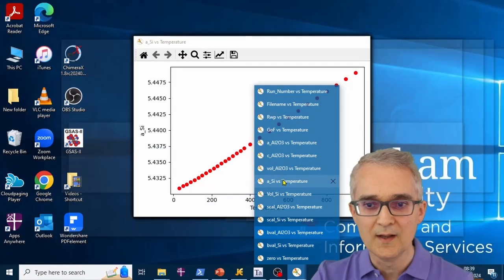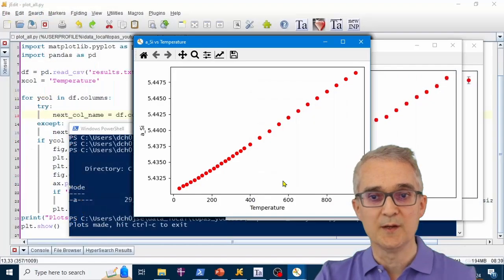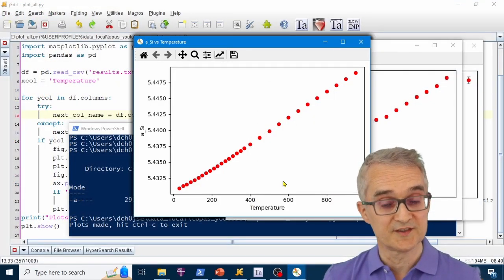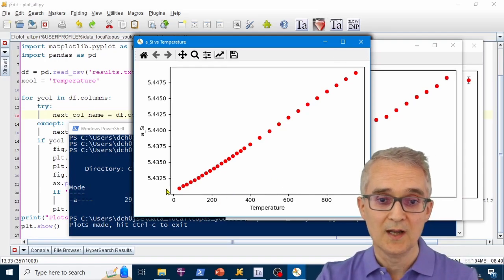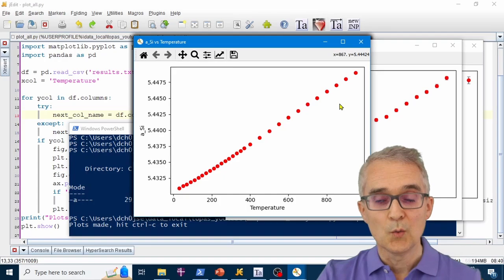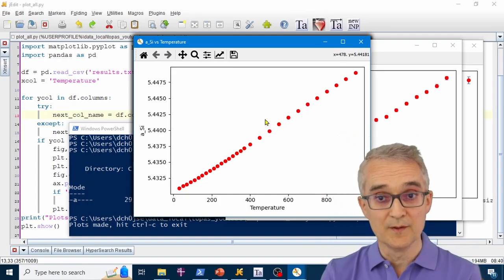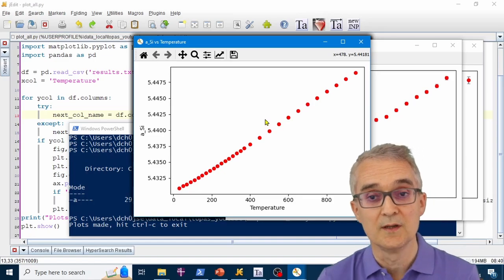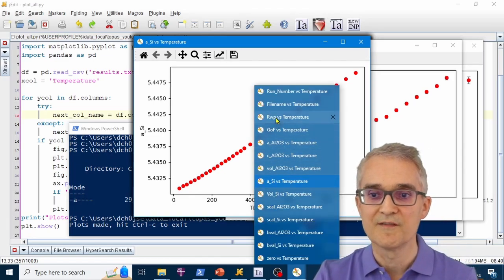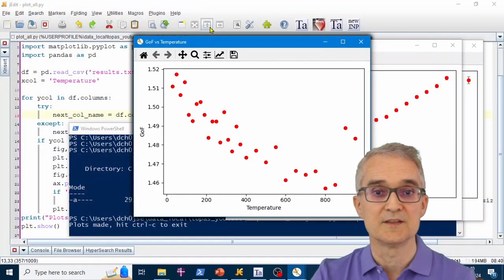The silicon cell parameter is the quantity that we're probably interested in for this experiment. We were trying to calibrate the diffractometer, so we wanted to know the thermal expansion of silicon to compare to the literature, and we can see that the silicon cell parameter is nicely defined. One of the key things you want to look at is the quality of the refinements when you're doing this kind of variable temperature work or this multiple sequential analysis. So it's really important to look, for example, at the R factor of the refinement as a function of temperature, or the goodness of fit as a function of temperature.